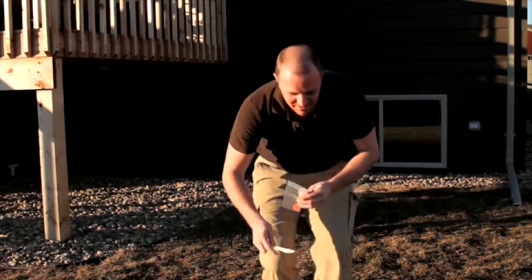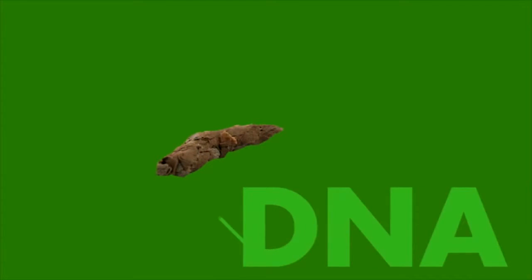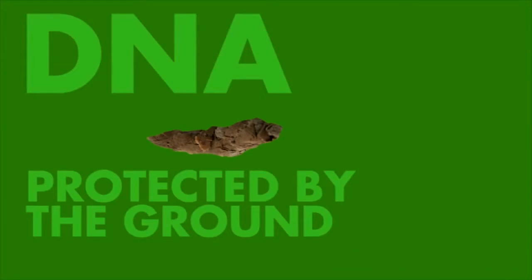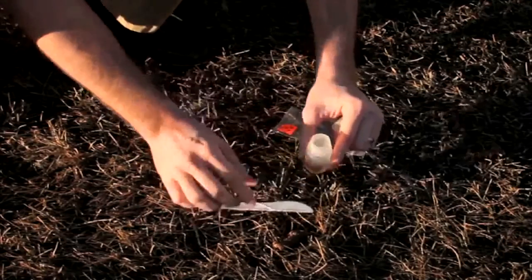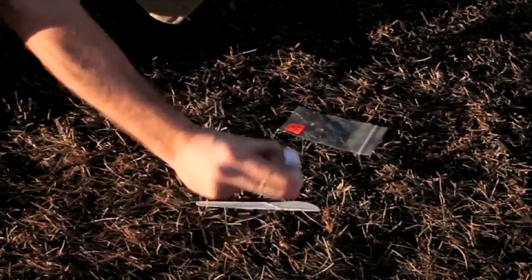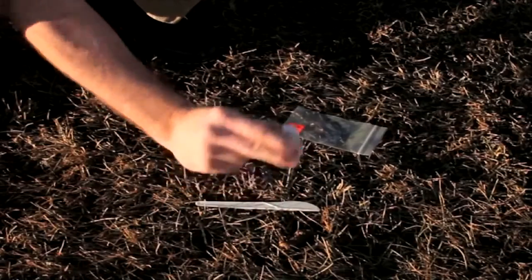Next, it's time to get a sample. Dog DNA is most prevalent on the outside of the poo and on the ends. For best results, flip the poo over. The bottom part of the poo touching the grass is protected from the elements. Now cut a nickel-sized part, put it in the collection bottle, and shake away. You're looking for a milkshake-like consistency.